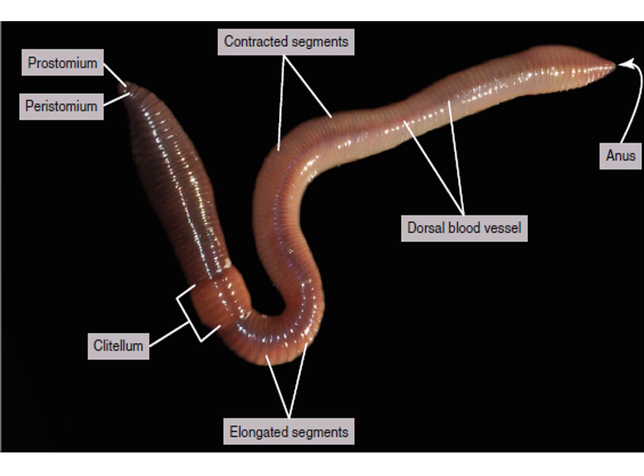The head of the earthworm is not very specialized, it lacks specialized sense organs, and it is considered a degenerate head, and it is not typical of the annelid. And we can find the segment at the posterior side, and it is the anus.